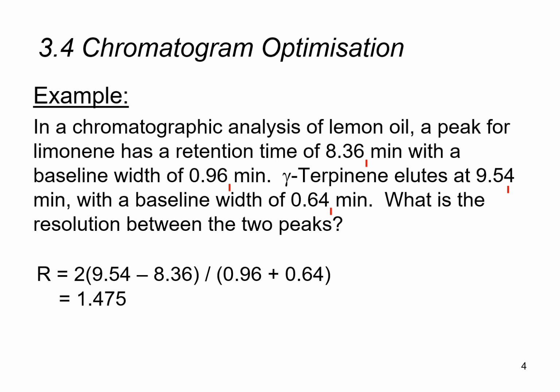So clearly it is greater than 1.2, which means that it is certainly sufficient for identifying or quantifying the individual compounds. Although it is somewhat less than 1.5, right, which is the threshold number that represents a very good or ideal separation.